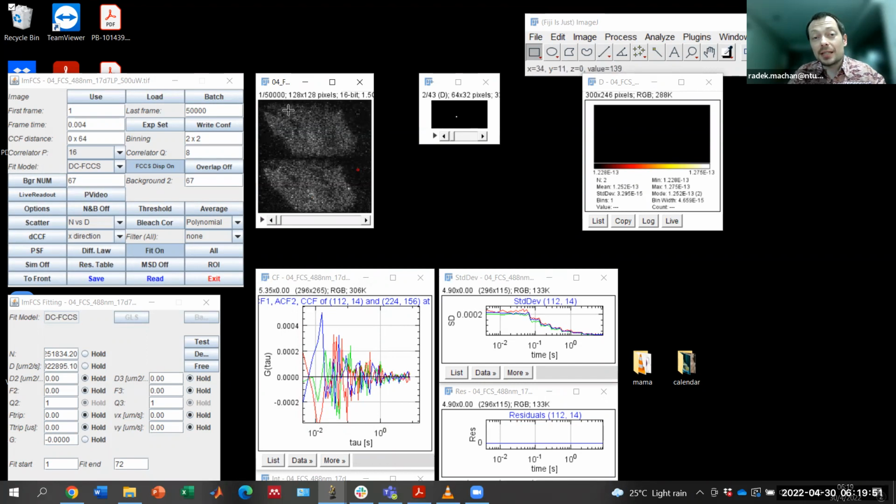And so it would make sense, for example, to draw a region of interest along the boundaries of the cell. Of course, you can use any tools which you have available in FIJI to define the region of interest. You could, for example, use some functions in FIJI or some macro to segment the region of interest, so that you only correlate what is the cell and what makes sense.